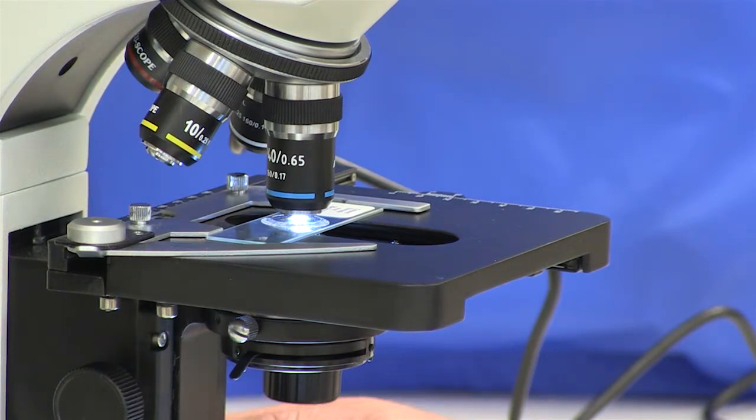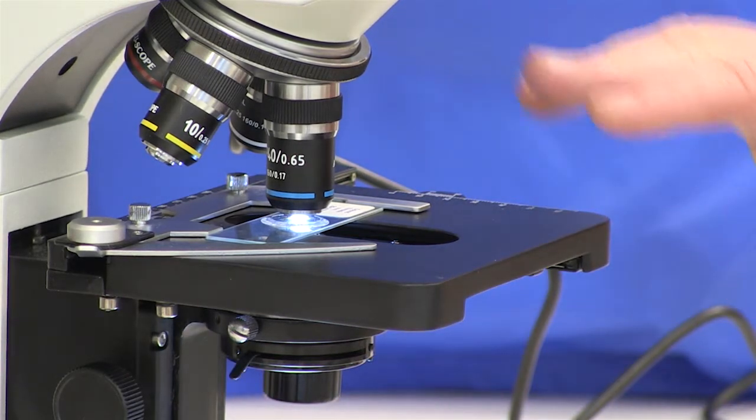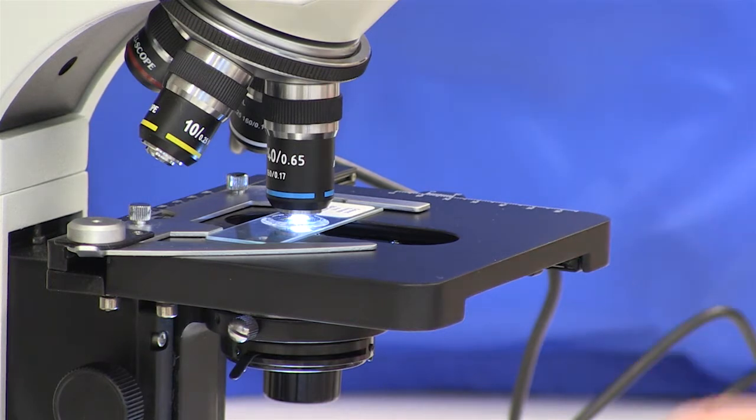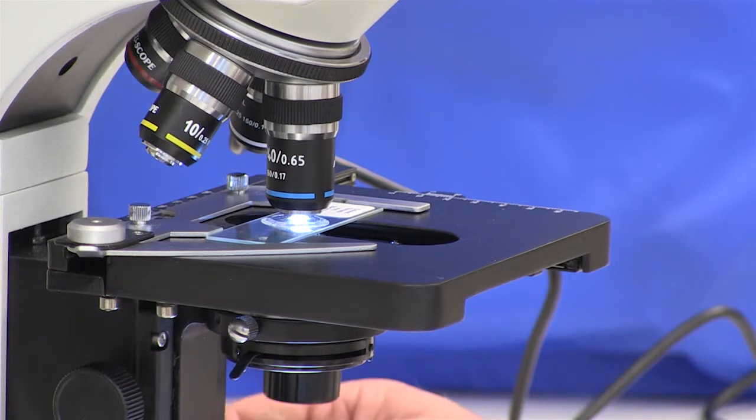Sometimes students will mistakenly use the coarse adjustment knob and they will move the stage so much that it hits the objective. That can break the slide and potentially damage the microscope. So it's very important to remember that we only use the fine adjustment knob when the high power objective is in place.